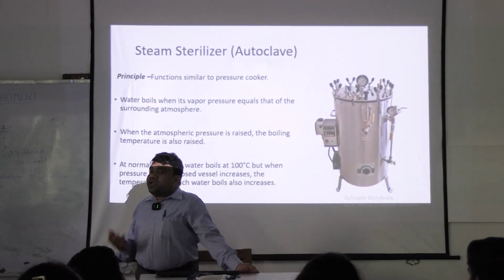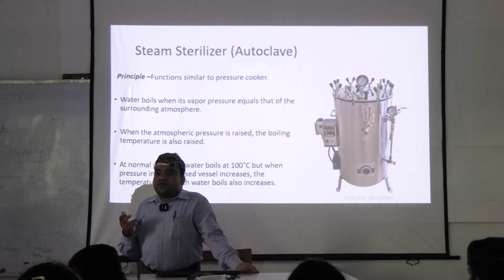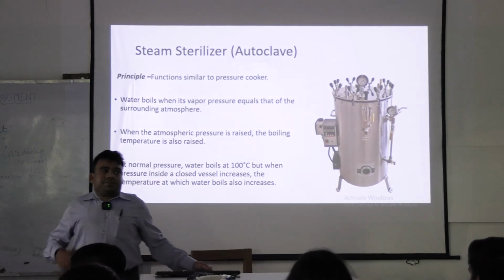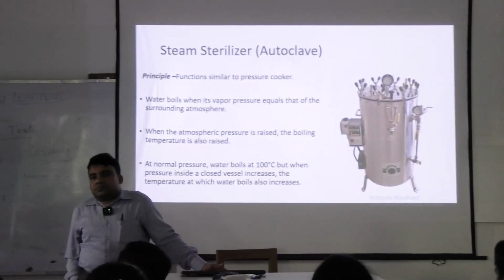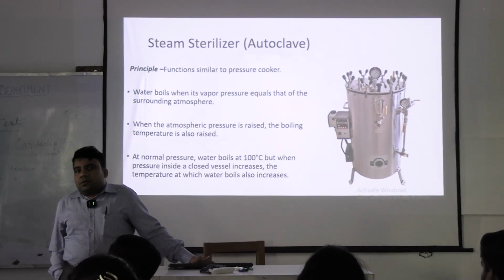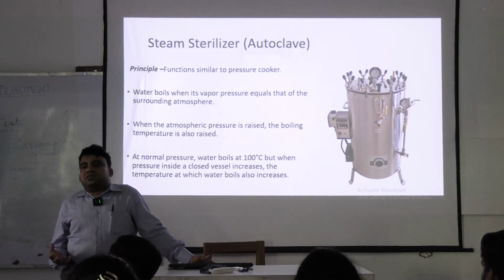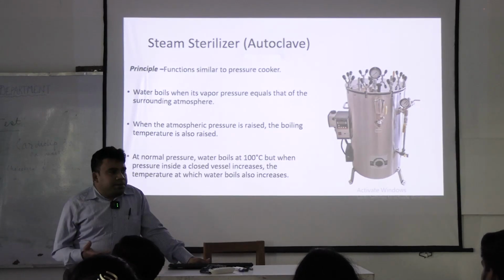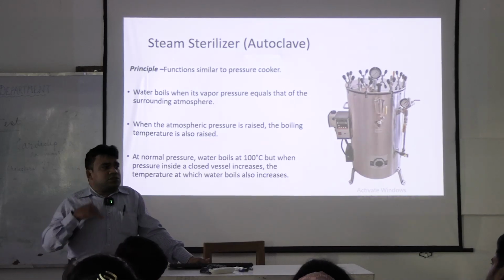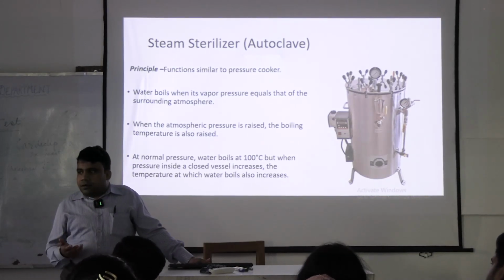And what should be the contact time? It should be at least 15 minutes. So, 15 minutes starts when? Now, what I am asking is, you have started heating water. The water reaches 100 degrees centigrade, it starts turning into vapor.